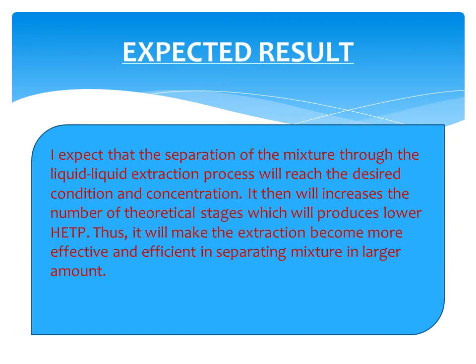The last one is the expected result of the whole experiment. I expect that the separation of the mixture through the liquid-liquid extraction process will reach the desired condition and concentration. It will increase the number of theoretical stages, which will produce a lower HETP. Thus, it will make the extraction more effective and efficient in separating a larger amount of mixture.